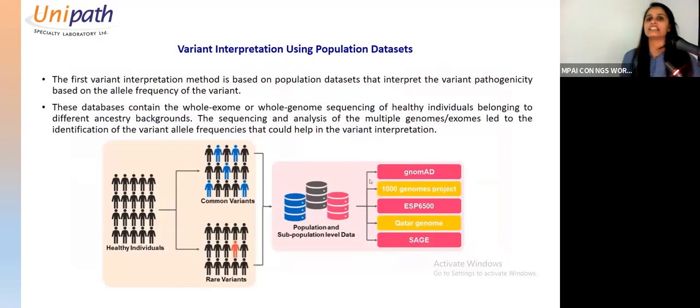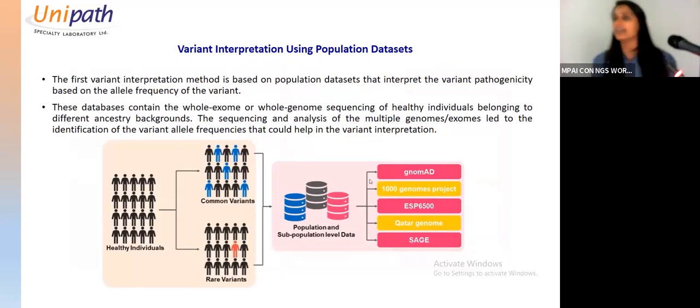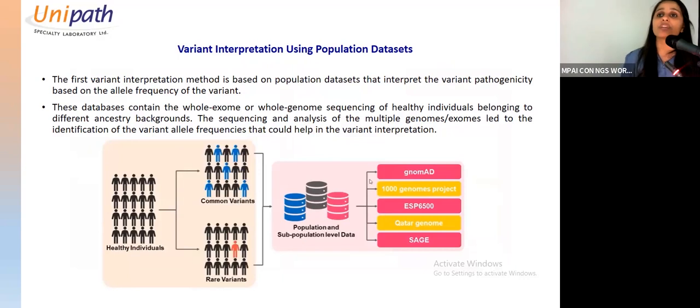One of the easiest ways to reduce your data from 40,000 or 50,000 variants is to compare it against a population database. Neeraj sir also showed in the slide the population frequency databases which can be used. Such a database contains variants called from the normal healthy population.